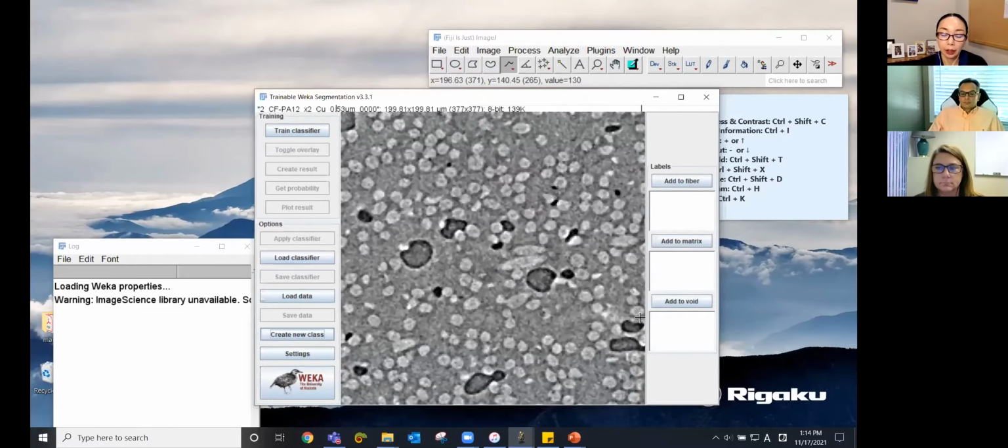So the first choice for the polling question was binarization. As you can probably guess from the name, binarization gives you only 2 classes. But when you use this one, you can have 3 or actually more. I think I've done this up to 7. So I know that it works up to 7 or more. Now we have 3 phases.